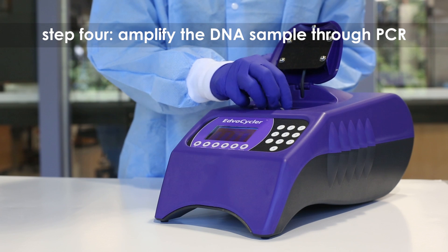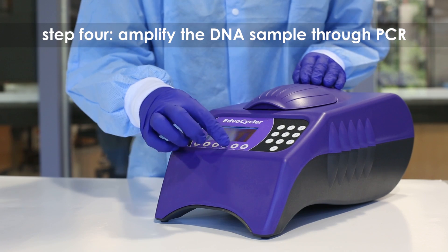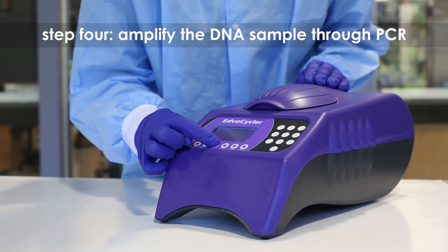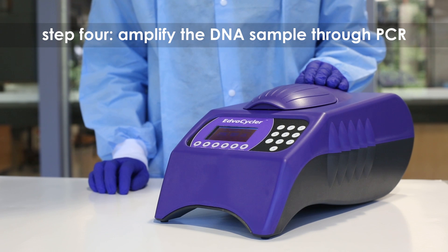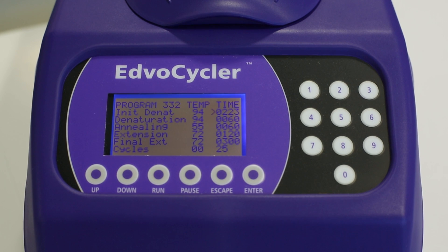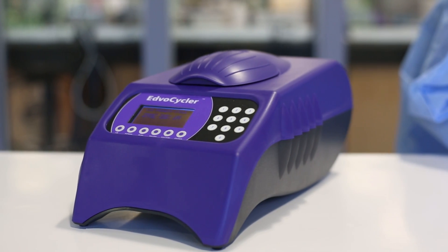Step 4: Place your sample in the Edvocycler and amplify the DNA using PCR. Inside the thermal cycler, the mixture is heated and cooled multiple times, allowing the TAC polymerase to copy the DNA template. Each PCR cycle doubles the amount of DNA in less than 5 minutes.